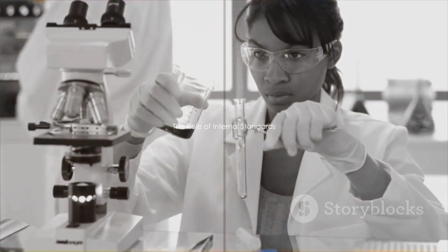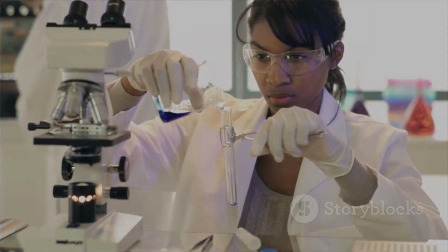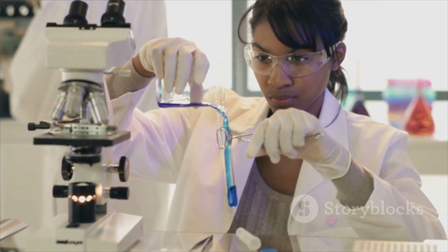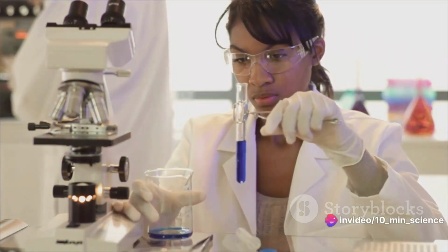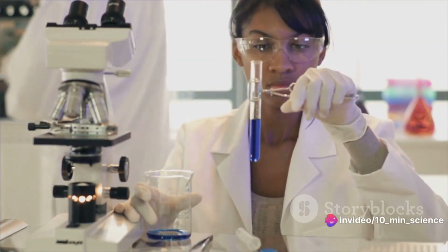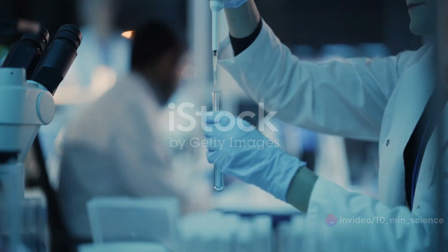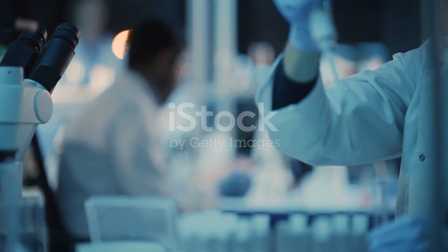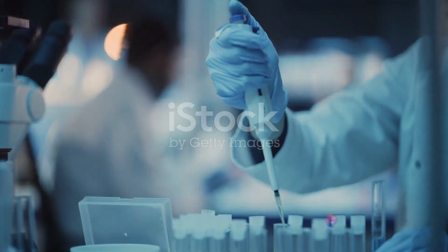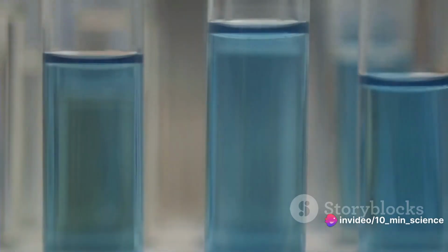So, how do these internal standards function within the realm of HPLC? Well, let's dive right into it. The role of internal standards is to correct any variations that might occur during sample preparation and analysis. They're like the unsung heroes of the HPLC process, working behind the scenes to ensure accuracy and reliability in your results. So imagine you're preparing a sample for HPLC analysis.